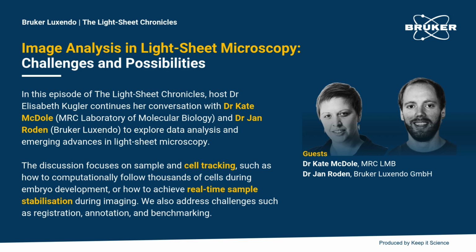And so this is obviously very, very complex. A lot of it is difficult just due to the quality of the imaging. In some tissues, even on our microscope, they're just very, very, very scattering. And so it's hard to get complete tracks out of it.